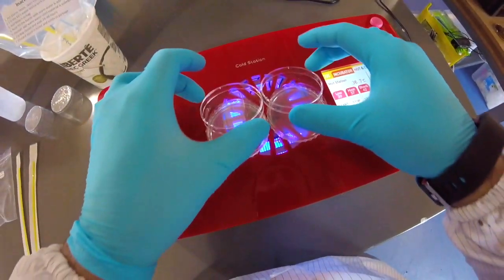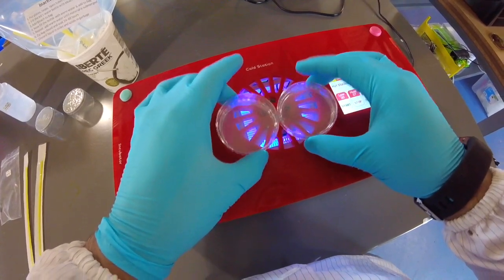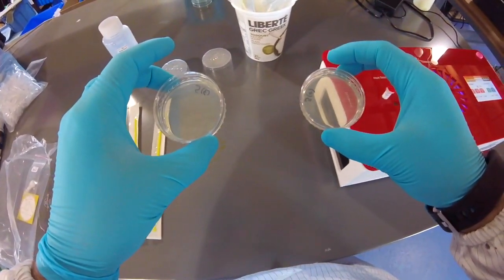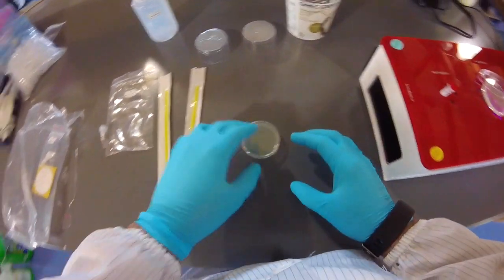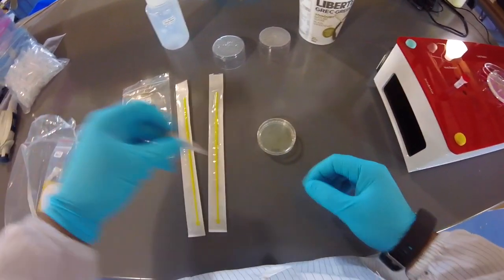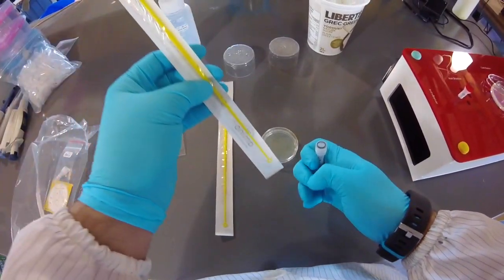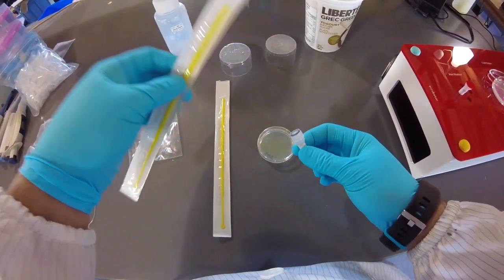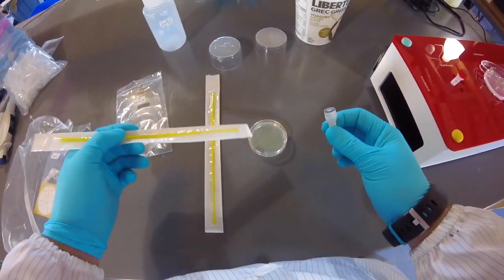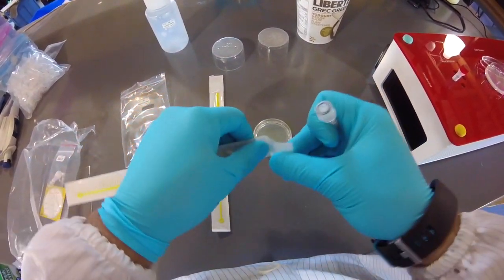All right, it looks like the condensation is now off of the lids, so that's good enough. Let's move on with our experiment here. Maybe I'll leave the experiment one on there momentarily while I do the plus. Okay, so we're going to do the plus first, and it's as simple as dipping your loop into this tube like you had done with the blank cells, and then we're just going to rub it all over the plate. Okay, so it's very much just like when you did your negative control.